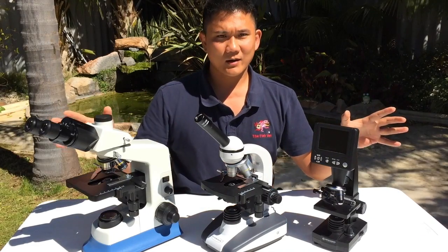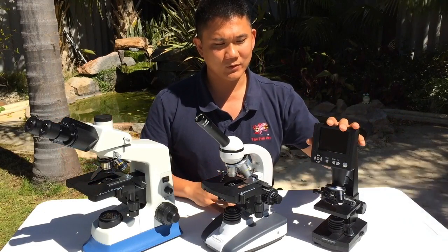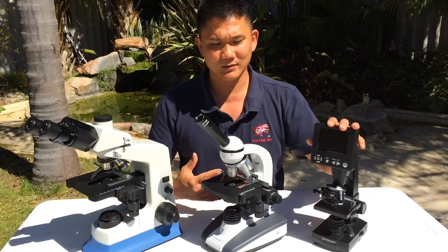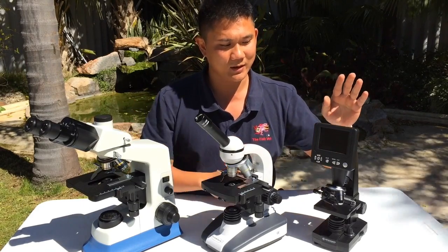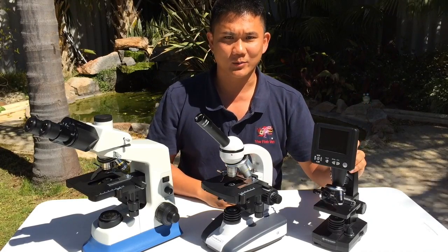We've got a range of microscopes here — something for the beginner, intermediate, and professional levels. We're going to start by talking about the beginner's microscope.